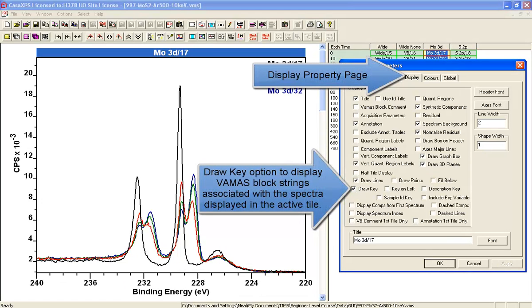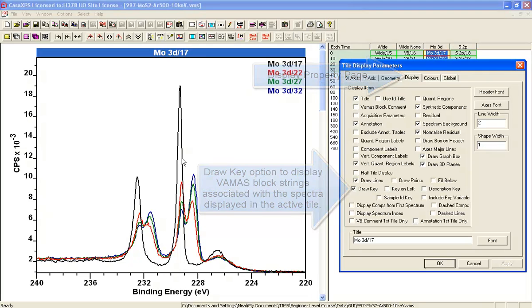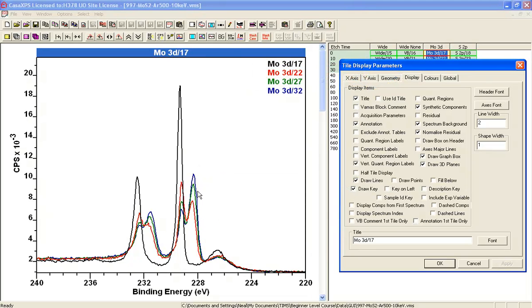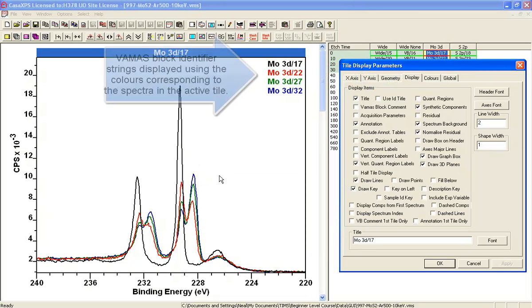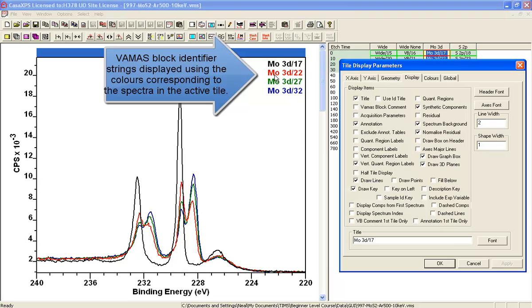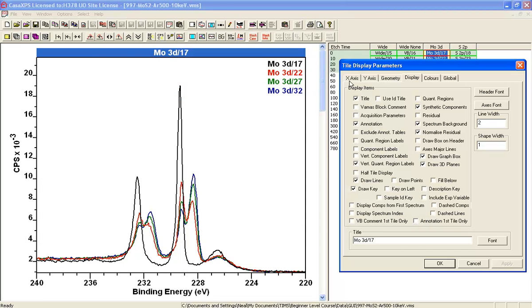So here we have the key and here are the colors that are displaying the molybdenum 3D17, the molybdenum 3D22, 27, and 32.